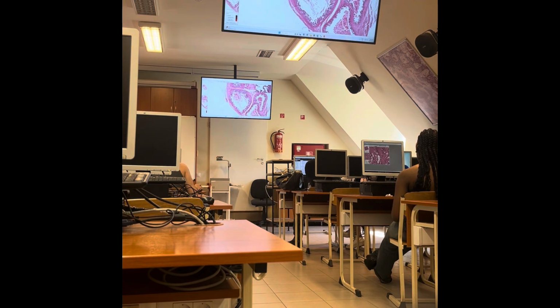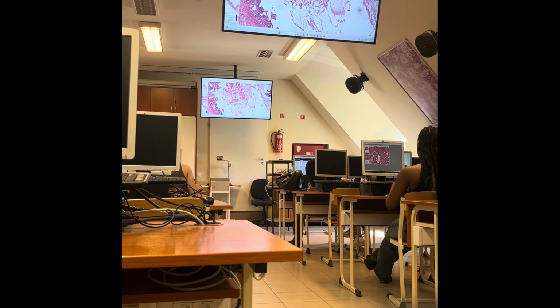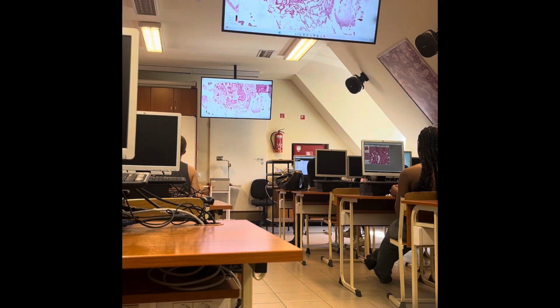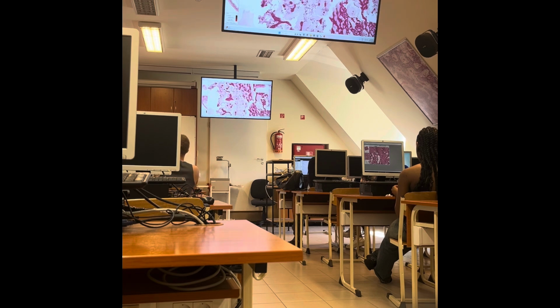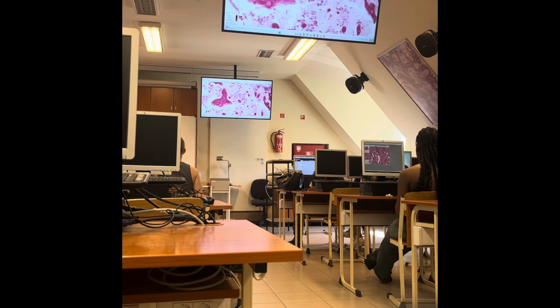And when I enter the other part of the specimen, we can see the seminal vesicle. In the lumen, you can see some concretions. Most probably it includes the product of the seminal vesicle, as amino acids and some proteins are in it. It has an eosinophilic coloration. If you see cells, that is most probably an artifact from the sectioning.